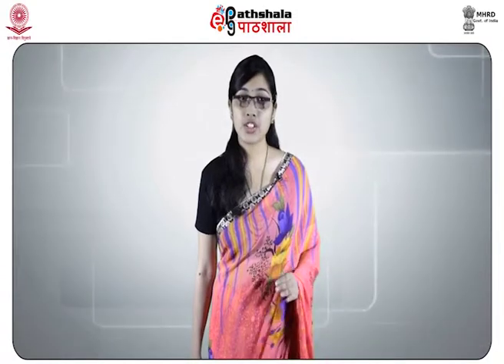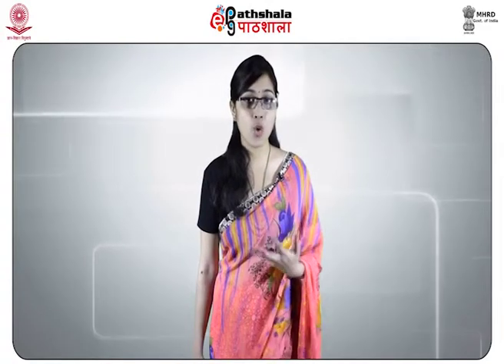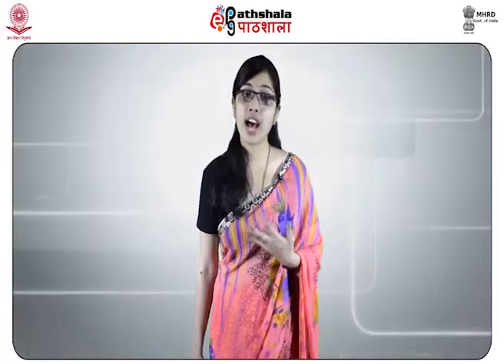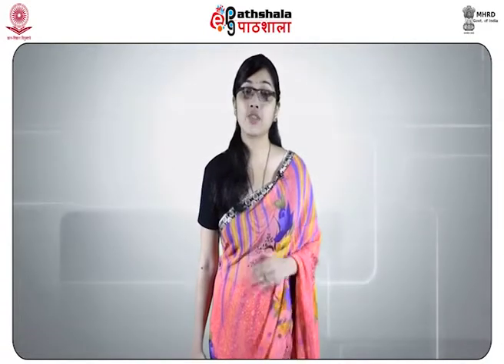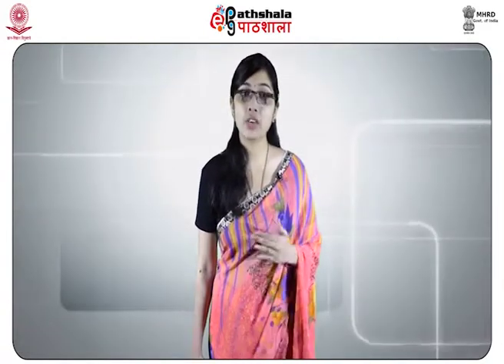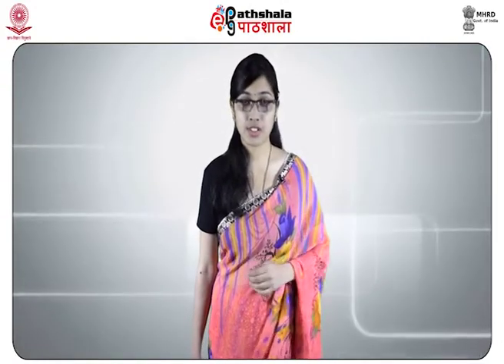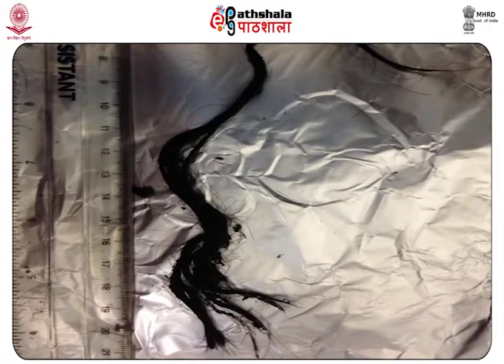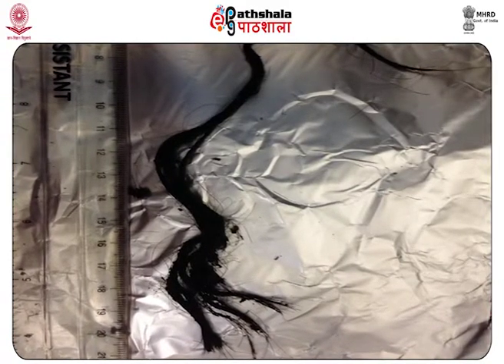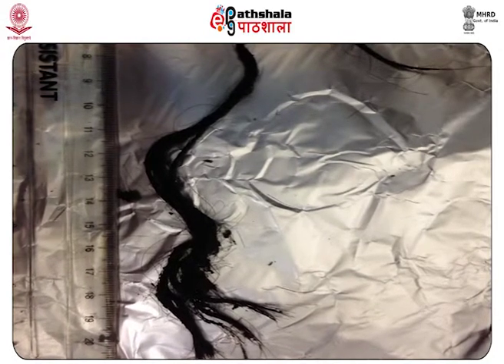Hair evaluation has always been utilized to determine the nature, the quantity and the period over which the poison had been administered in slow poisoning cases. In case of Napoleon, the nature and quantity was determined after about 140 years. The hair evidence as a corroborative evidence is available in most of the serious cases, especially in offences against person.